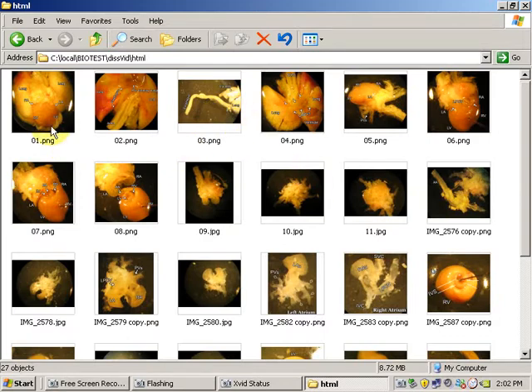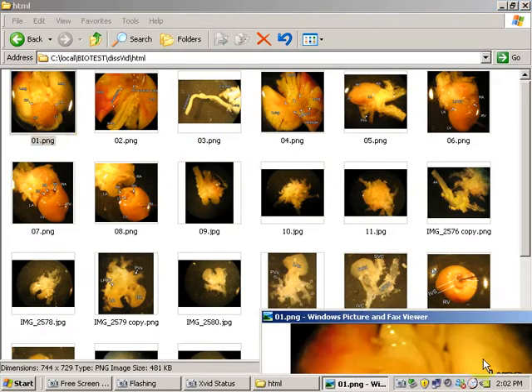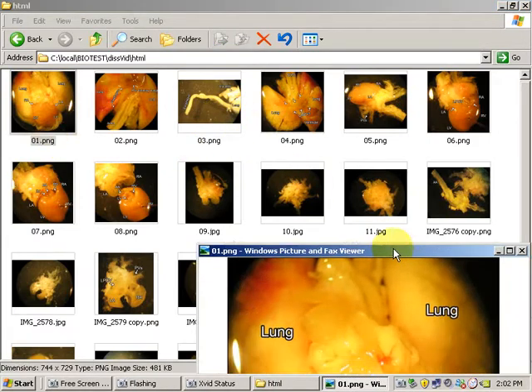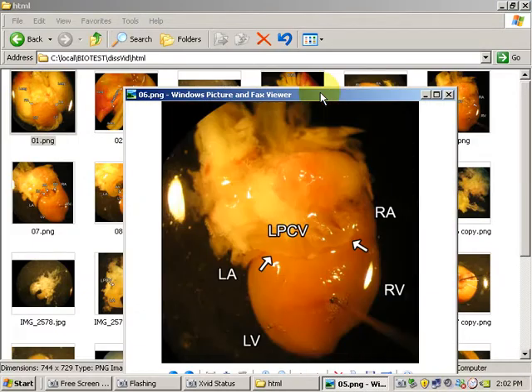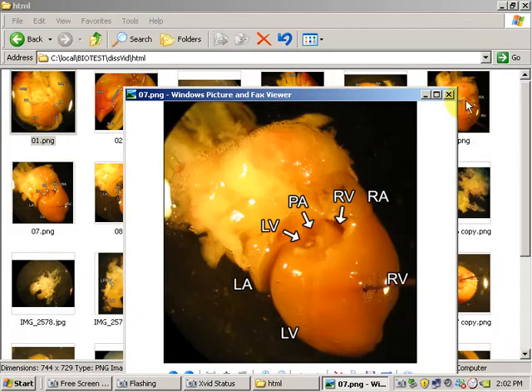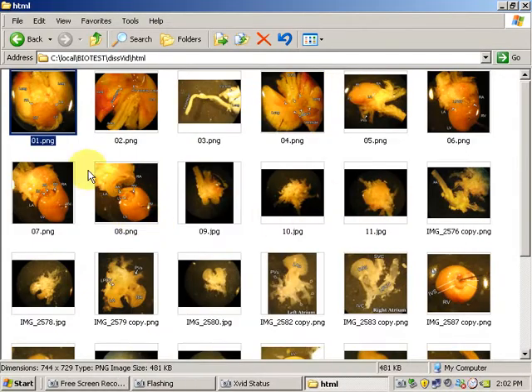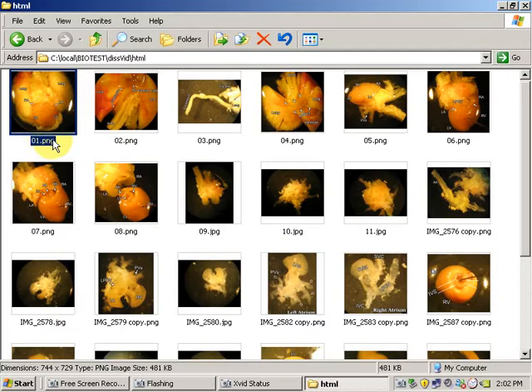As you can see, these original images have all been labeled appropriately, and they have a combination of filenames between PNG files and JPG files.